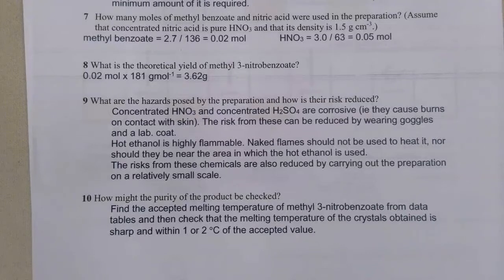There are quite a lot of hazards which are posed by this preparation. So firstly, you're using concentrated sulfuric and concentrated nitric acids. Both of those are corrosive and cause burns on contact with the skin. So when you're adding the nitrating mixture dropwise, it's useful to be wearing gloves. Hot ethanol is flammable, so trying to heat that can be quite challenging, and that's why we usually do that in a water bath.